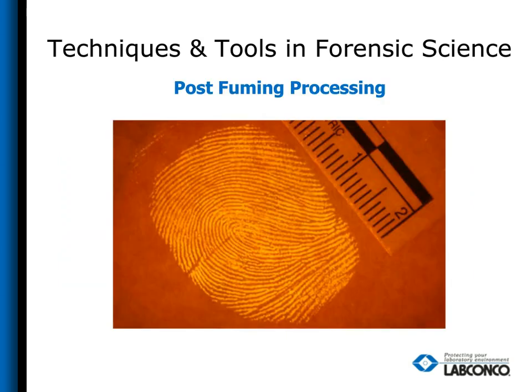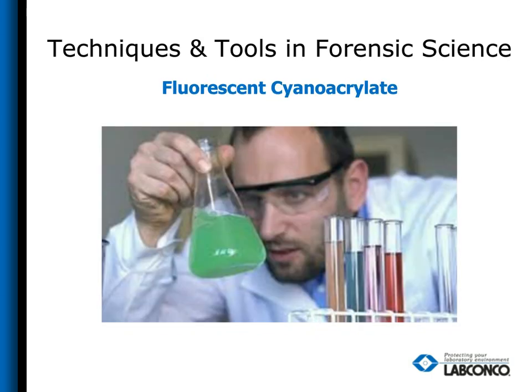And lastly, with CA is after we get the fingerprints fumed. There are several techniques to make them more visible with different dye stains, photography, ultraviolet or infrared types of photography. New on the market, and what we're seeing more and more, is the cyanoacrylate glue that is infused with actual dye stain in it. There's a couple different brands in the market right now. We've had great success using them.